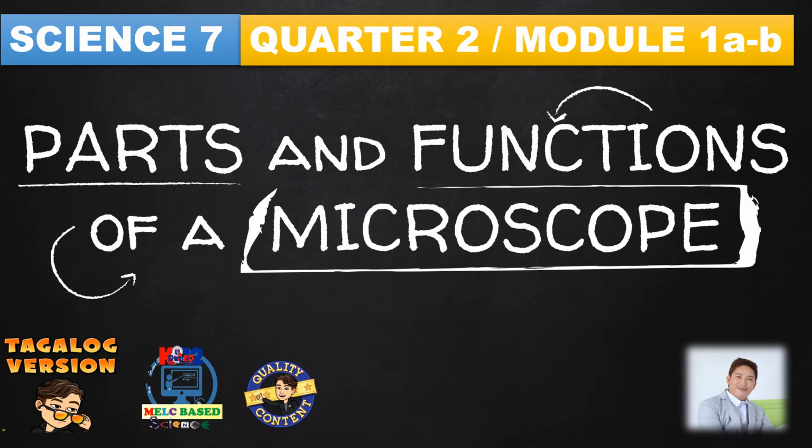What we are going to focus on for today is Science 7, Quarter 2, Module 1, A and B. Ano nga ba yung nilalaman ng module na to? This focuses on parts and functions of a microscope. Kabilang na rin yung computation for the magnification and yung proper use of microscopes. So are you ready?